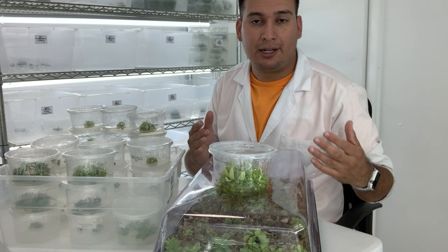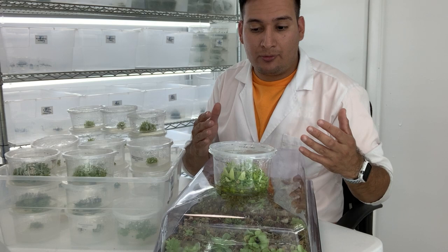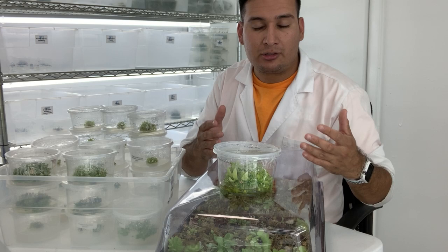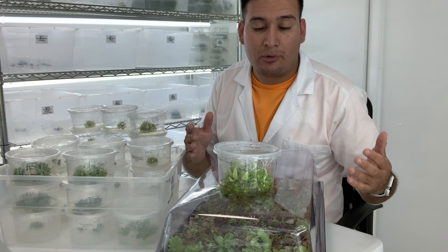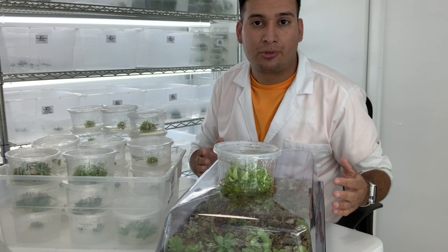Not all of them will survive, but let's say I have 100 plants per container. I already used one container, so I have 11 left, but in total let's say I have 1,000 plants. This is a Mexican Pinguicula, and if you check how much these plants cost, they're between 10 to 20 dollars — maybe even more — per plant. So if we have 1,000 plants, that's equivalent to close to 10,000 dollars. That's how you make 10,000 dollars worth of plants in one day.